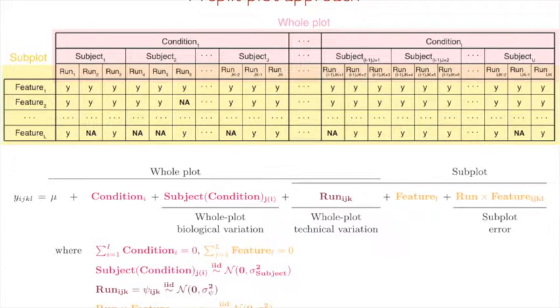Or we can do the next step and just focus on the pink part of this diagram and essentially use our t-test if we have two groups or extend this to other models. So that's really what's going on. So we will have two steps. One is where we focus on the yellow part, and we will do the summarization, which accounts for missing values and so on. And the second step will work on the biologicals.